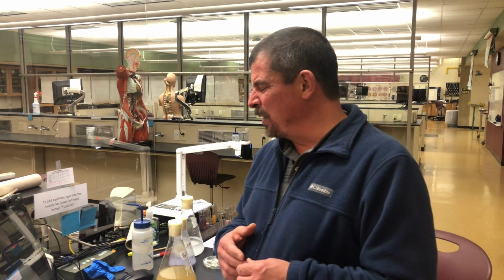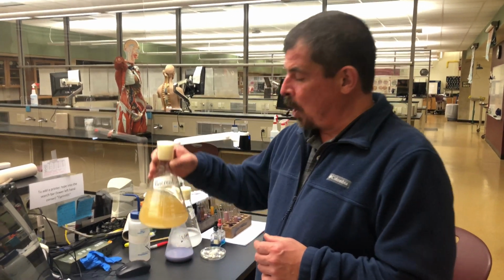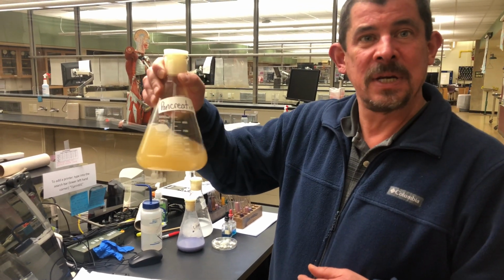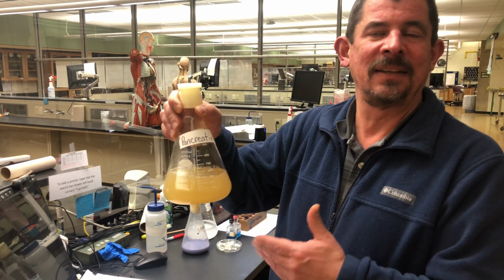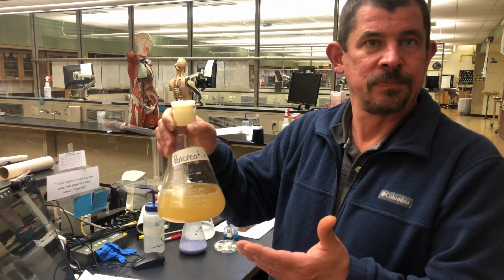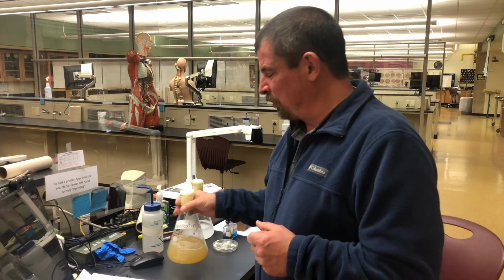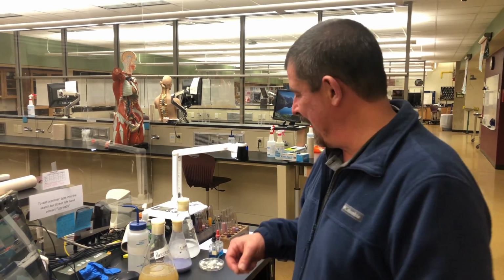So that is the protein source, egg whites. In one of the test tubes, we are going to add a small amount of what we call the pancreatin solution. The importance of the pancreatin solution in this experiment is that it contains the enzymes which speed up the rate of digestion. So in one test tube, we're going to put the egg whites and just distilled water, and in the other test tube, we are going to add the pancreatin along with the egg whites.